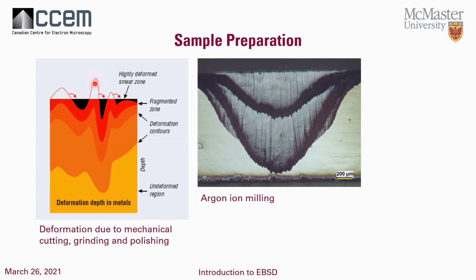The black areas and the little dotted red lines represent the actual physical scratches on the surface. If you only remove damage down to this level, it will look perfectly polished in a light microscope, but you will still have a lot of damage in the surface.